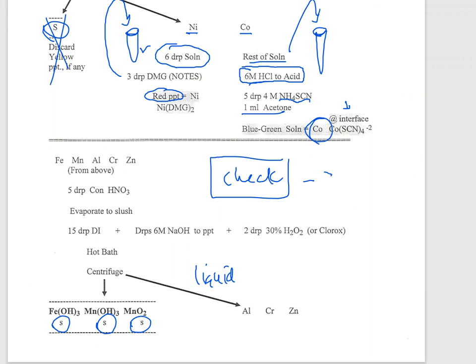So if we see a questionable point, like, no, you should have had this, you need to go back and maybe retry it. Then we'll have you go back and retry it. And we might even watch you do it just to make sure that you're doing it the proper way. But do check your answers with the lab instructor before you leave for that particular day. Very important that you do that. So that way we know if you're doing the test the proper way or not.